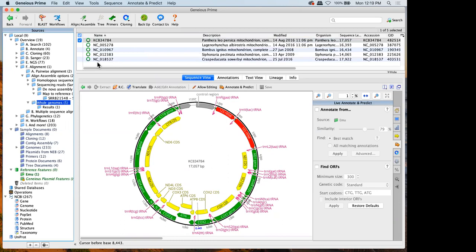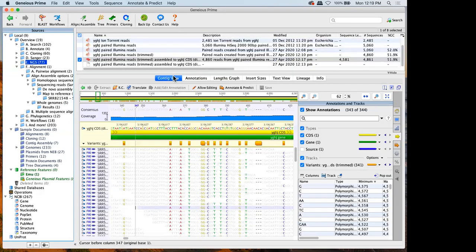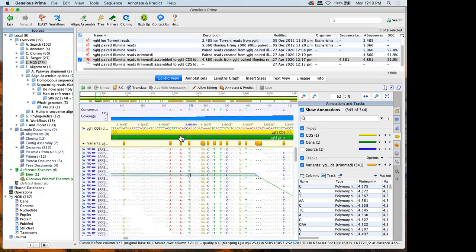Hi, Helen. This is Rebecca. I had a quick question on the Find Variations/SNPs tool. What you displayed, is that a variant caller, or is it just displaying any mismatch with the reference? So it's a little bit of both.